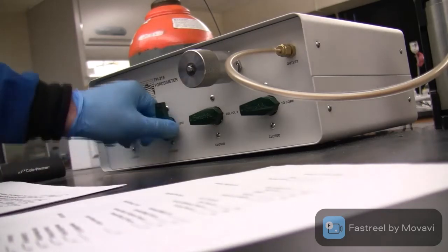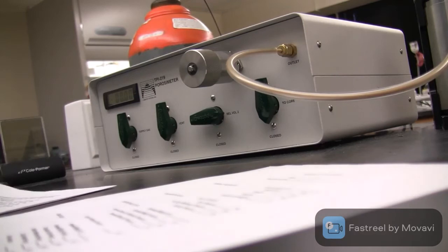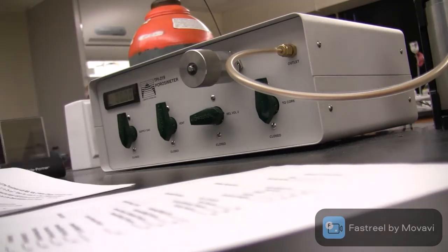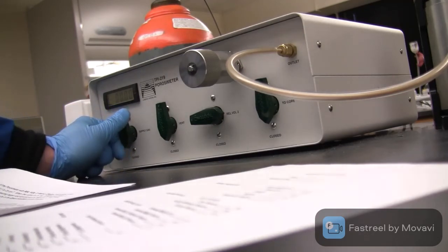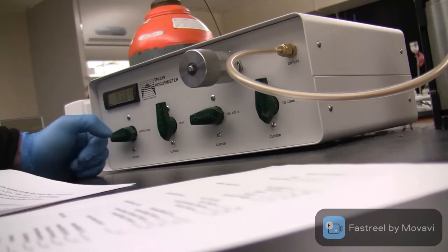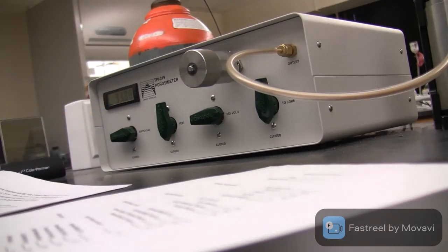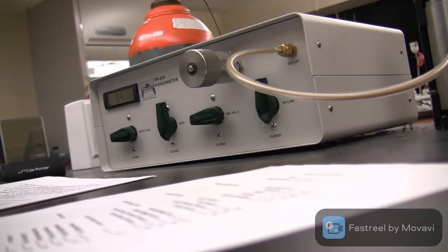So we need to close the vent and the pour valve one more time. And after closing them, you open the supply gas valve. It should go back to close to 94 point something. And wait until it stabilizes, same process.